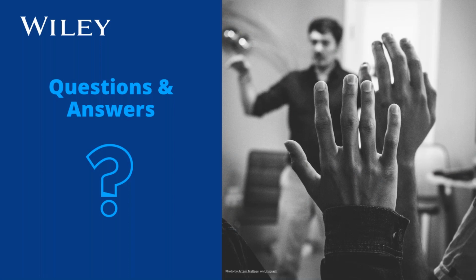Thank you. We might have time for maybe one or two more. How about, quantitation software can be really challenging to use. What does KnowItAll do to ensure the usability of the software? The software uses step-by-step dialogues.